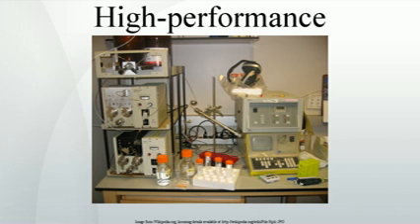Another important factor is the mobile phase pH, since it can change the hydrophobic character of the analyte. For this reason most methods use a buffering agent, such as sodium phosphate, to control the pH. Buffers serve multiple purposes: control of pH, neutralize the charge on the silica surface of the stationary phase, and act as ion pairing agents to neutralize analyte charge.